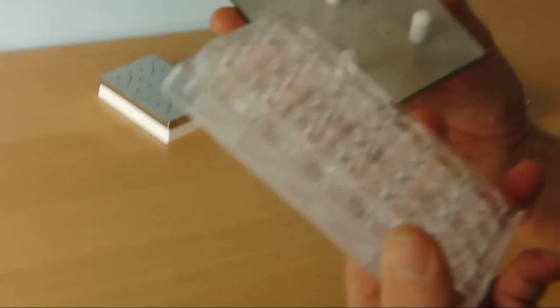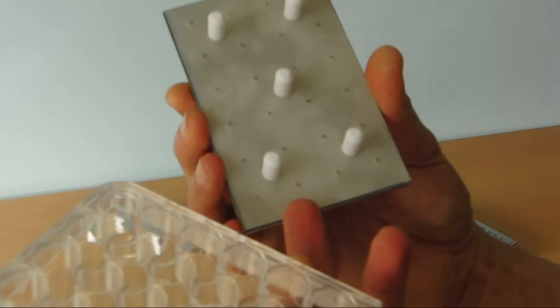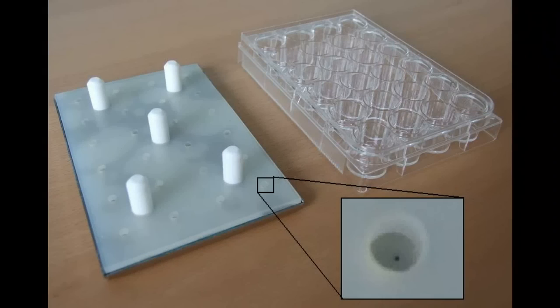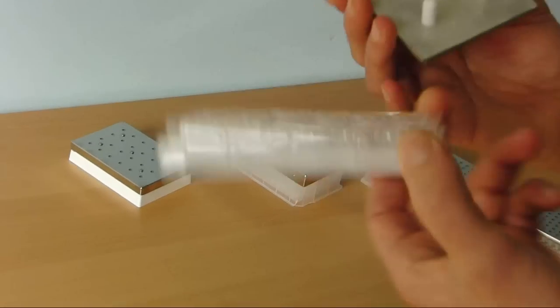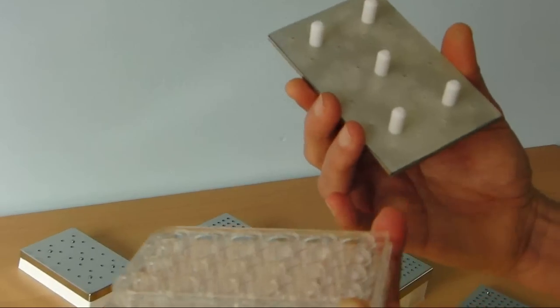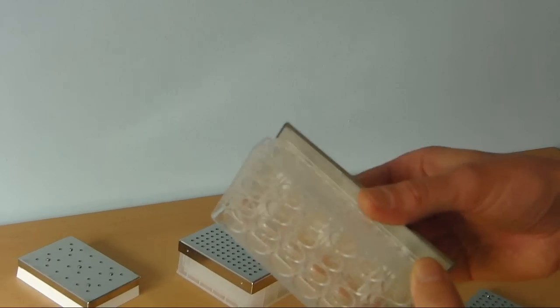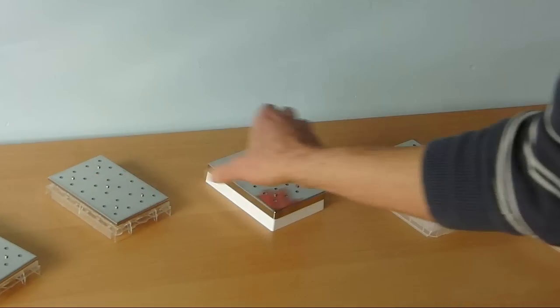The latter type of sandwich cover has an extra layer—a thin stainless steel foil with a tiny hole of 0.2 mm above the center of each well. This kind of sandwich cover is especially suitable for animal cell cultivations. As said, these covers are only applicable for Corning microtiter plates.